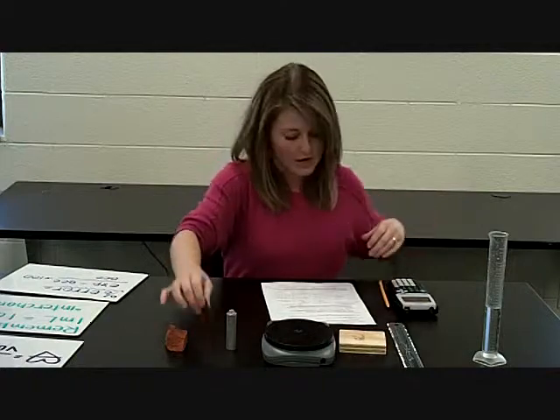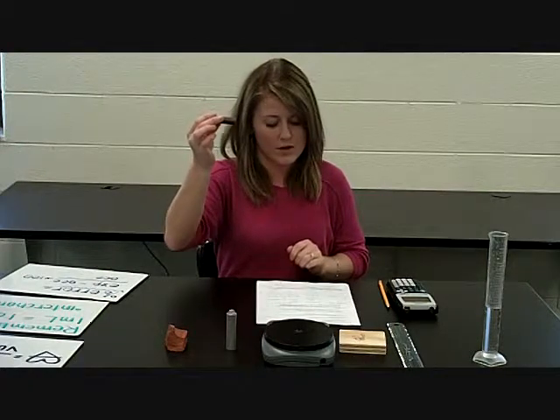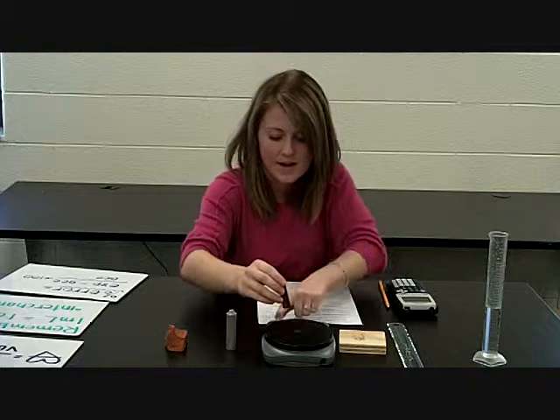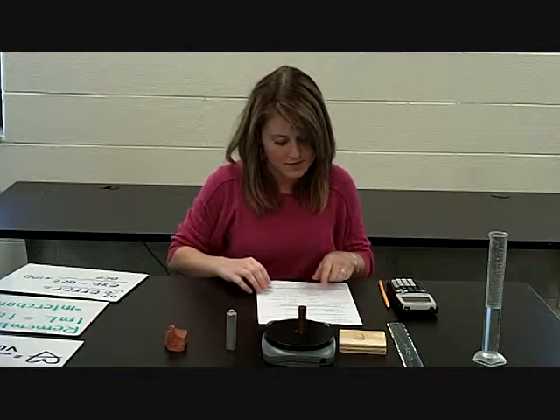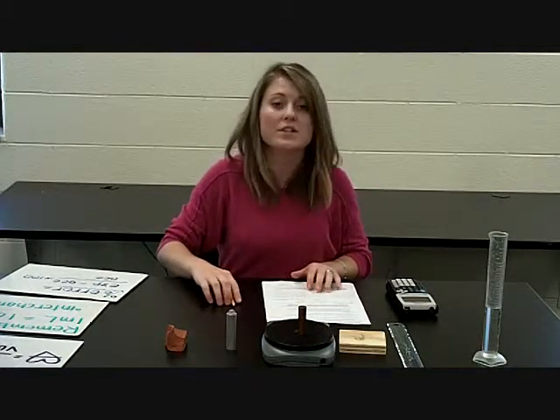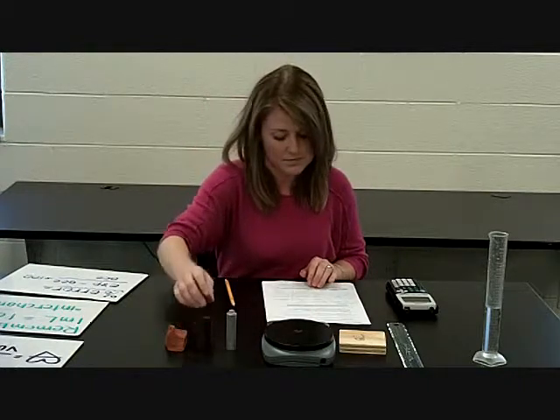For object 2, our plastic rod, which we're using the brown one in this video, the volume you should already have is 10.7 milliliters. Let's go ahead and find the mass of that. You write it in your data table here, and you get a mass of 14.1 grams for this brown cylinder.